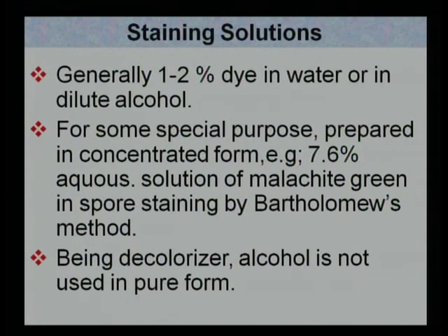Because when you use a higher concentration of stain, either in water or in alcohol, there is a possibility of evaporation. As a result, it may lead to the precipitation of the dye on the structures or in the cells, and that may lead to formation of artifacts observed under the microscope.